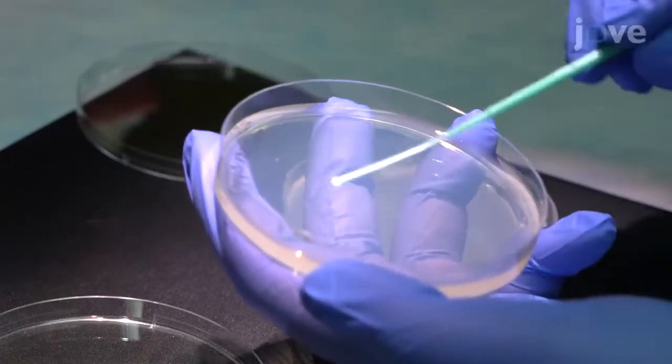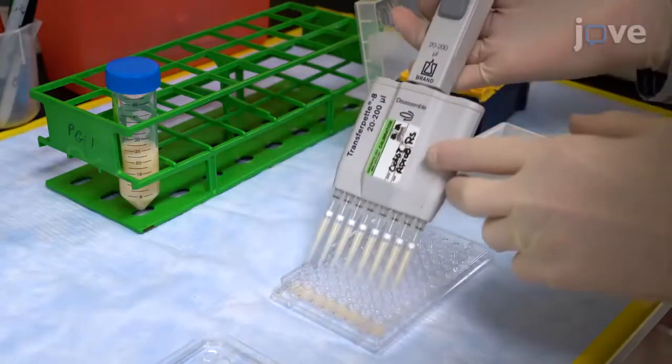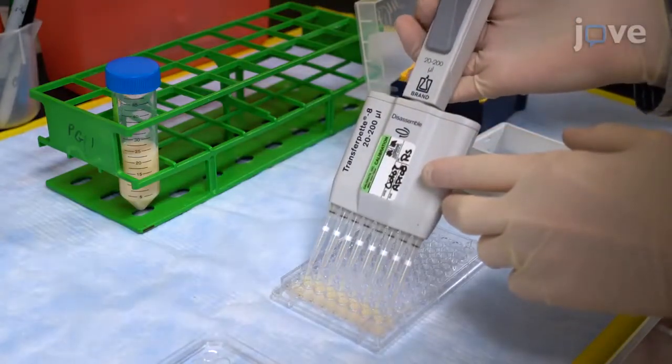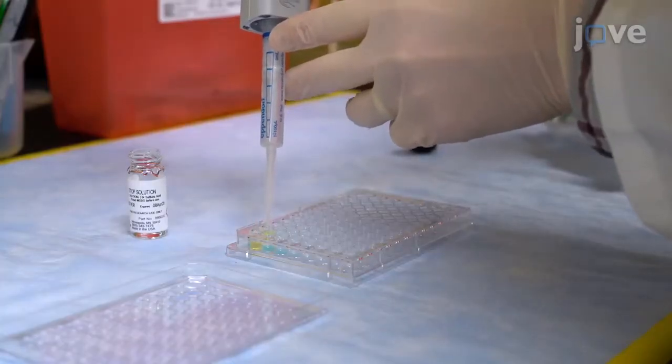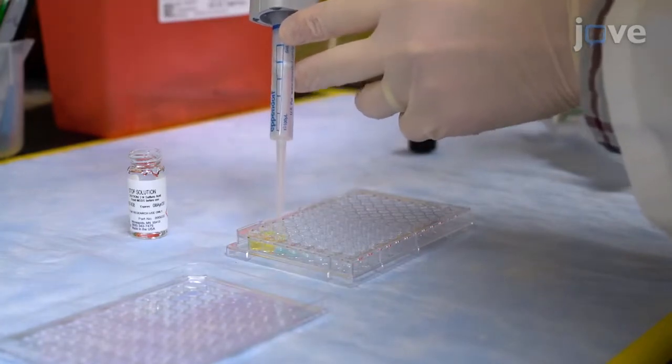This protocol also details a safer, more sensitive ELISA method for alginate quantification as compared to the standard uronic acid carbazole method, enabling direct alginate quantification in samples without culturing or sample manipulation.